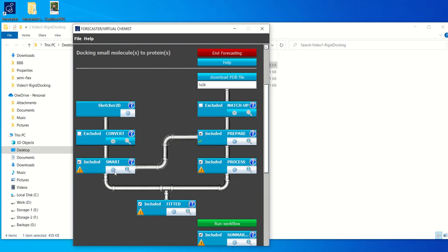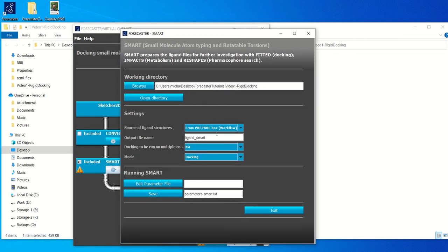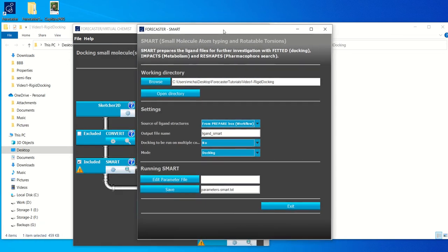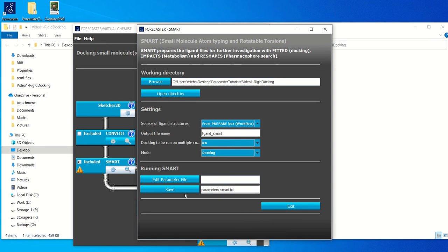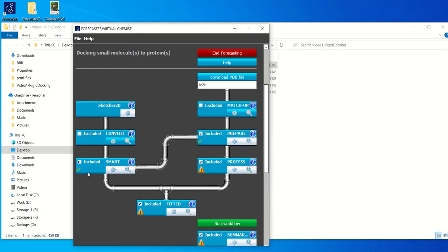Then what we're going to have to do is we're going to have to prepare the ligand for docking. So in this particular tutorial, we're going to do self docking, which means that we have to use the native ligand and then try to dock it back to the structure and see how well we perform. For this we use Smart, which is a module within Forecaster. And Smart will prepare and format the ligand in a way that fitted our docking program is used to seeing. Usually by default, you don't need to change any of the defaults here and you can just click save. Again, you'll see a little check box once this is done.